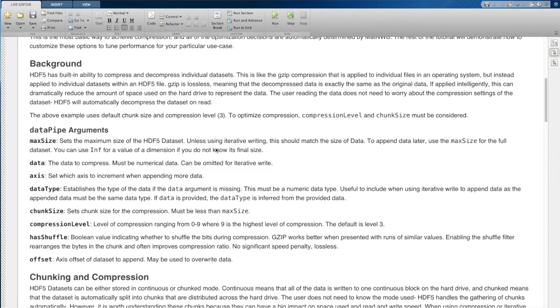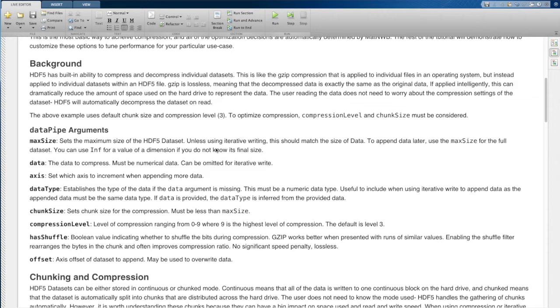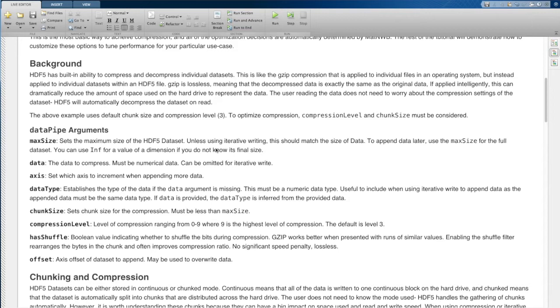The difference here is that we're not going to be gzipping the entire NWB file. Basically, what HDF5 allows you to do is zip specific data sets within an NWB file. When you do this, you have the potential to use way less storage.